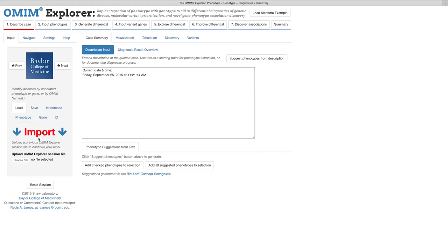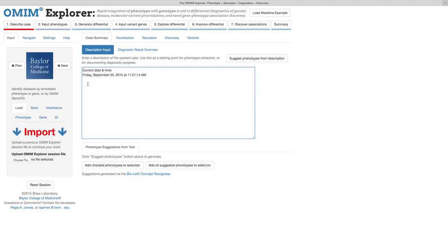But since we're creating a session from scratch, let's begin by entering some text into the description box. For the purposes of this tutorial, I've chosen Kleefstra syndrome as an example case and have spiked a known causal EHMT1 variant for the syndrome into a filtered version of a healthy individual's exome VCF, made publicly available by Manuel Corpas, the individual himself.